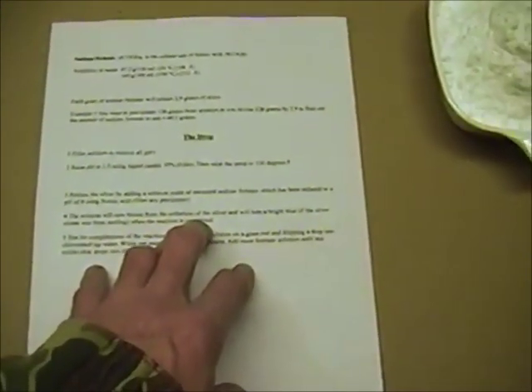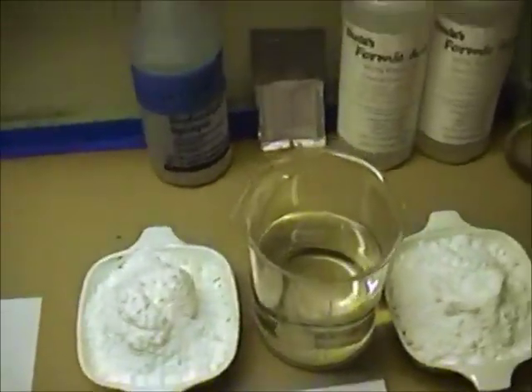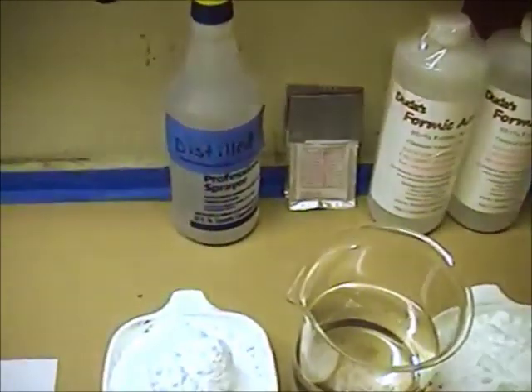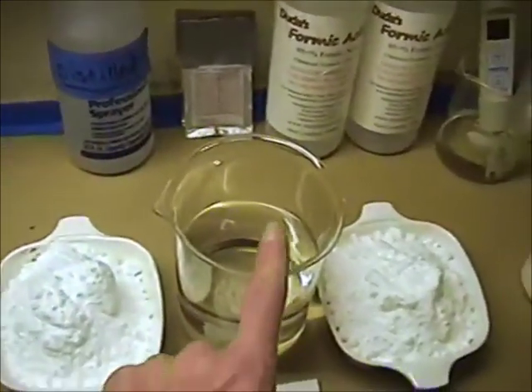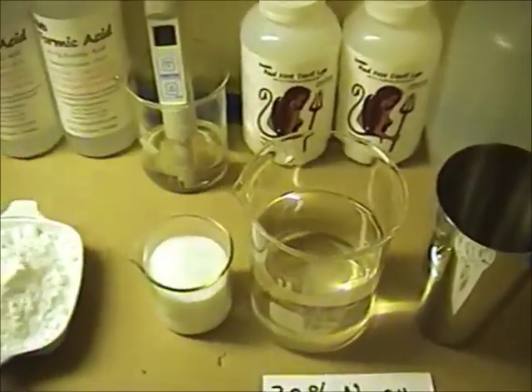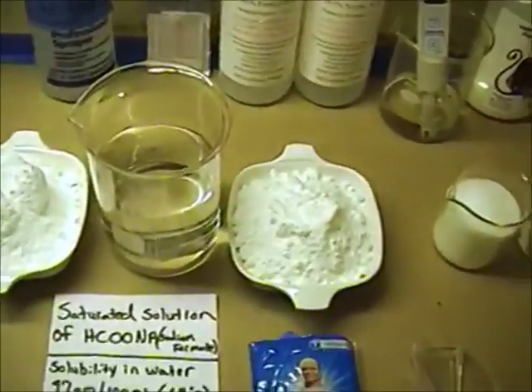Okay, over here I have some notes as far as the process. This is just my personal notes. Now, something I want to point out: in my spray bottle back here, I have distilled water. In these beakers is distilled water. You don't want to use anything but distilled water in this application.